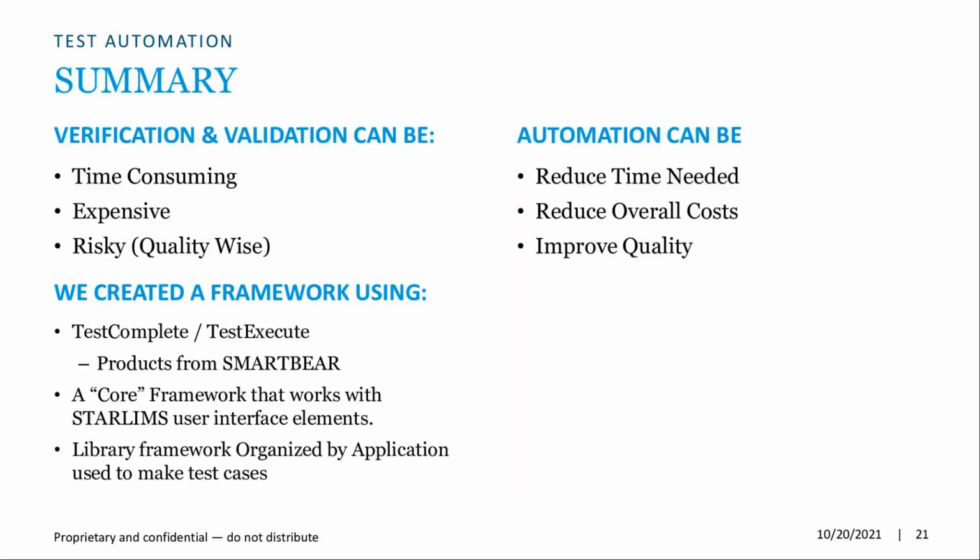And so for a summary, I just wanted to explain that verification and validation can definitely be time consuming. I know that most of us that have dealt with validation can agree that it is time consuming. Because of the time consumption, it can be very expensive to do. And it's also risky from a quality perspective, because if we're doing it manually, you're going to have human error.